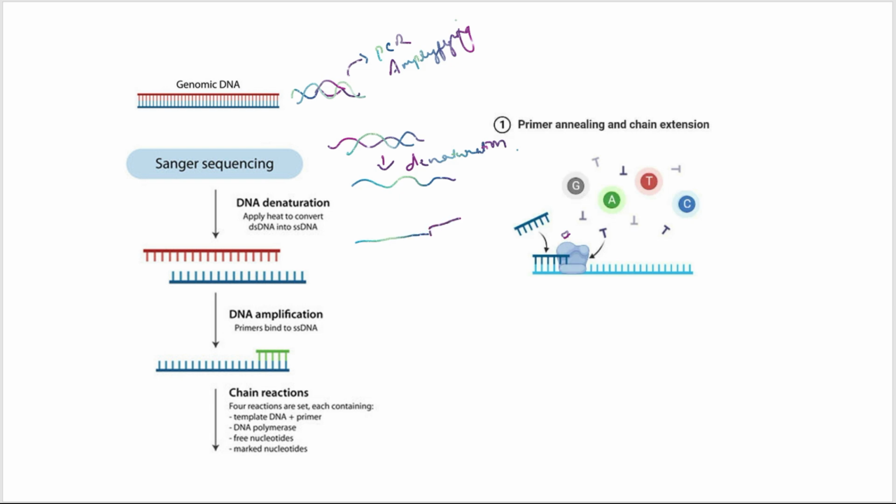So in the end, what we have to do is ligate some known product. If we are ligating some known sequence, then by seeing this known sequence, we can design a primer. So already we have designed a primer. So what do we have to do now? We have to extend this DNA. So here the primer is annealed.